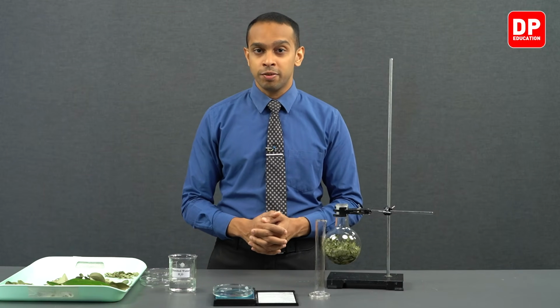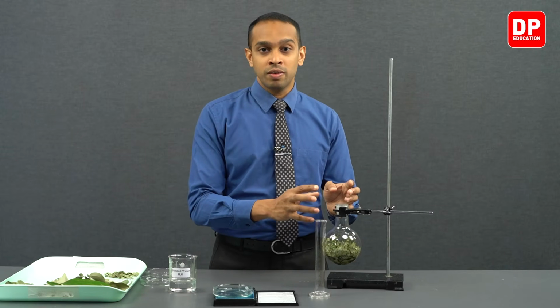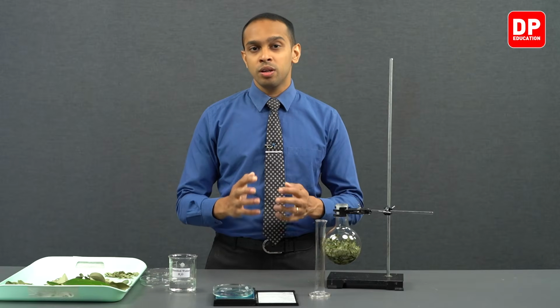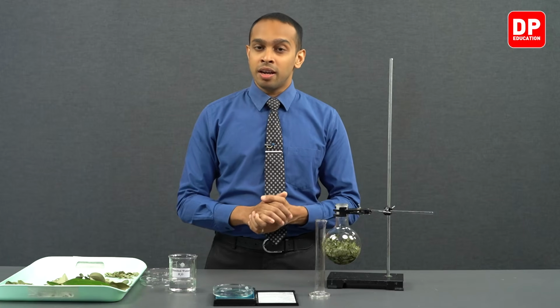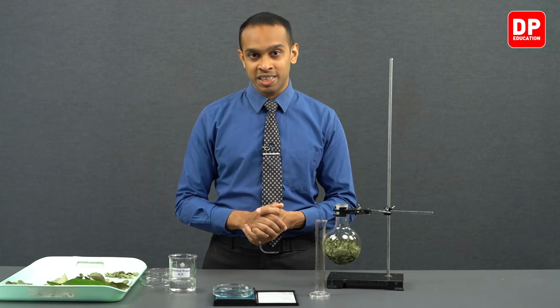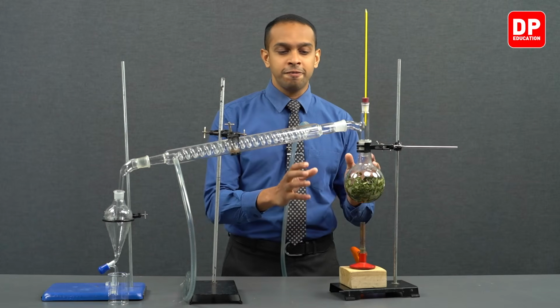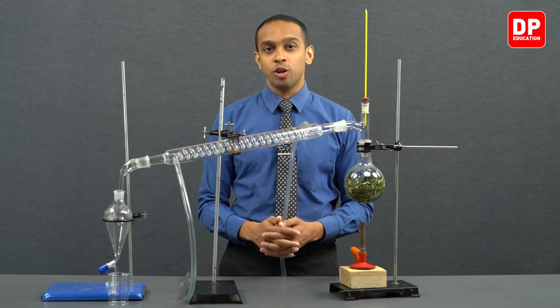Now all that is left for us to do is connect this round bottom flask into our extraction setup, where we'll be connecting this through a three-way adapter and then to a Graham condenser. Now let's move on to setting up the rest of the essential oil extracting setup. Students, let's observe how we have fixed this setup to extract our essential oil.